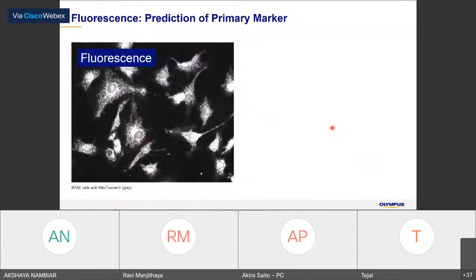So of course, we can use the fluorescence image. Even though this is labeled with mitochondria, for us it's quite easy to understand where the nucleus is, so you can very easily understand this is the nucleus, this is one.